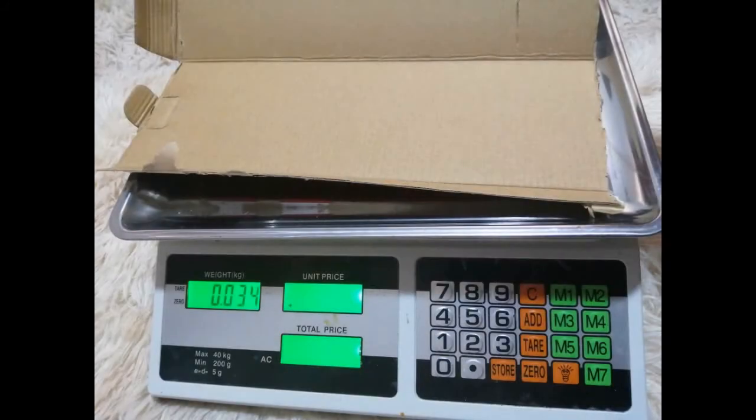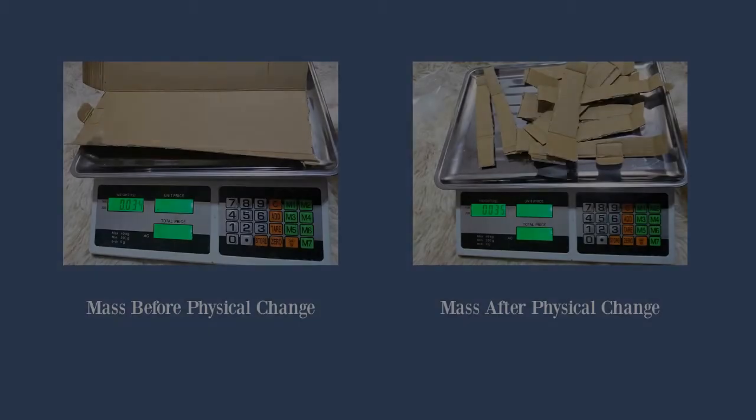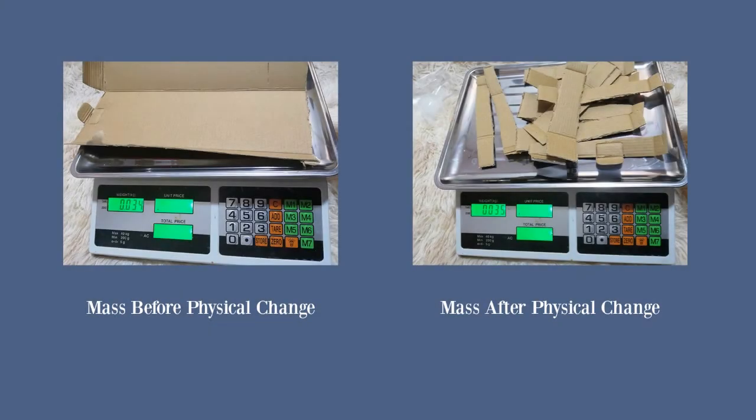For this experiment, we can see the conservation of mass present as we cut a cardboard into 10 pieces. Mass is conserved in nature. Changing the arrangement of parts during a physical change does not change its mass.